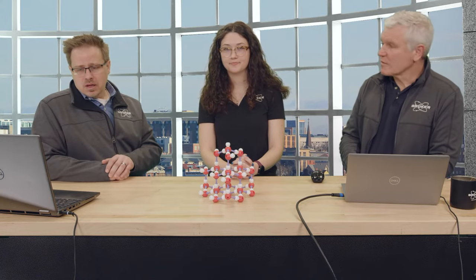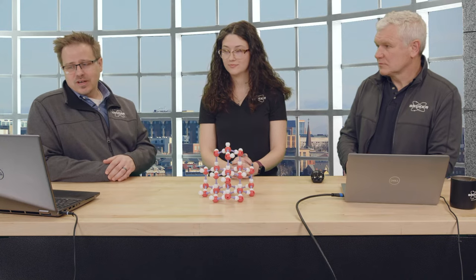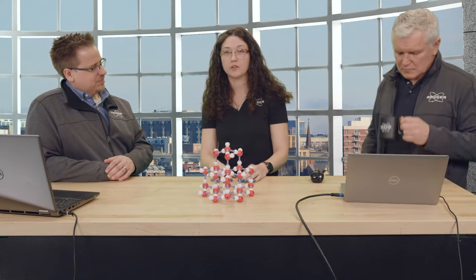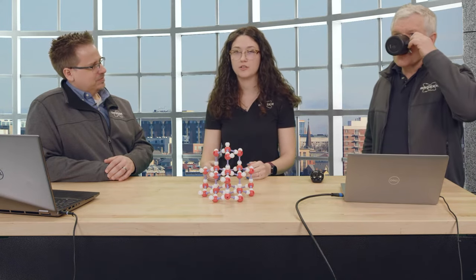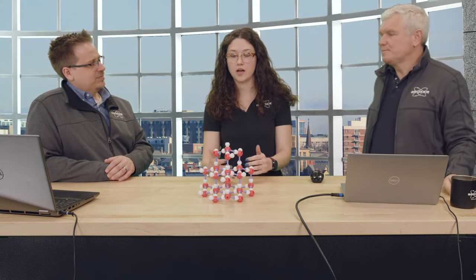All right, next question from Justin. Can I download the Apex 5 software? You can absolutely download the Apex 5 software. If you have a Bruker instrument, log in with your serial number at brukersupport.com, and you can download it there. You can also reach out for a demo license if you're interested in that as well.